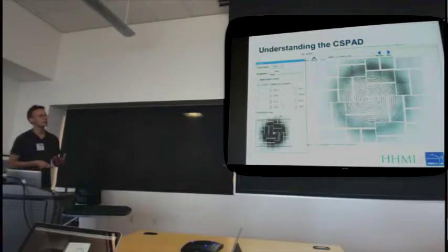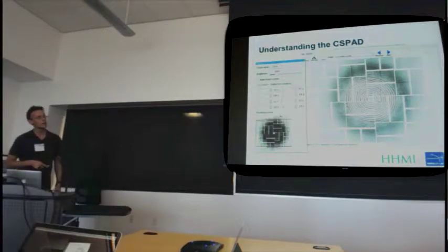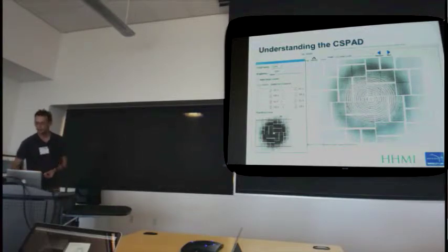And that ring pattern could be arranged such that it would also tell you something about the distance of the detector. So basically in one procedure you could arrange the quadrants such that the rings are concentric, arrange the distance such that the location of the rings match what you would expect from the particular sample that gave rise to those rings. So that's really only the first step in this procedure of calibrating the metrology, because it turned out that while this is enough to get stuff indexed, basically it's good enough to get a foot in the door, it's not quite enough to do things accurately.